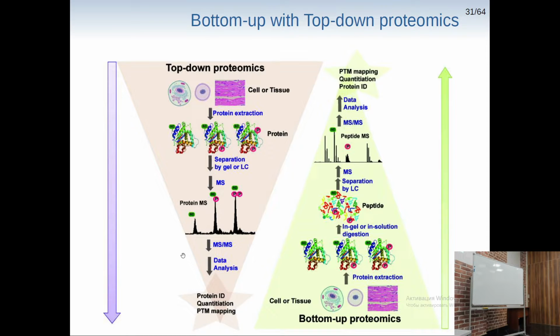Or we can go to top-down proteomics, when we first separate our proteins and then get some small set of proteins to be analyzed this way. And also we can analyze the whole proteins before the trypsinization to get information on post-translational modifications. And afterwards we actually can trypsinize them and analyze them as well. So, is the difference between those two approaches clear?